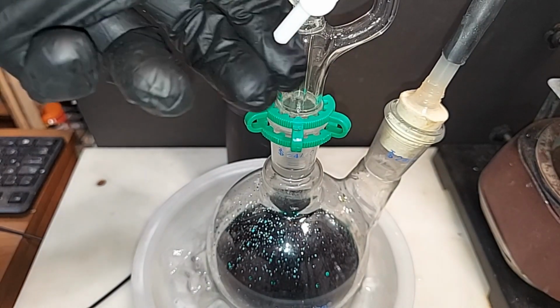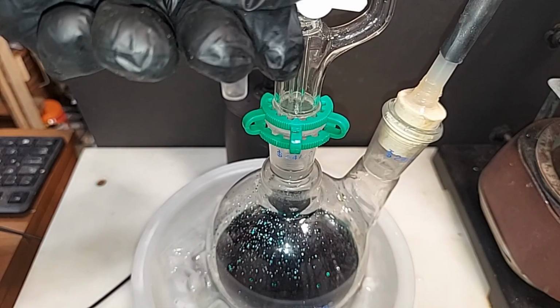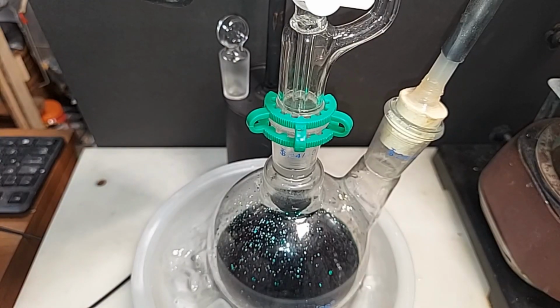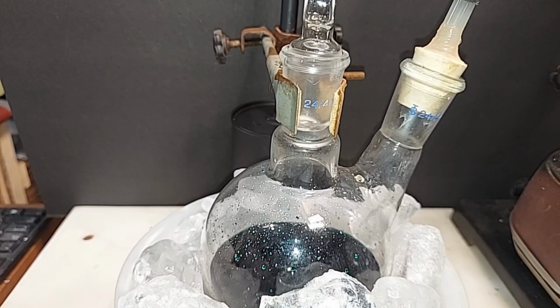Everything just dripped through. That took just over an hour to do, so I'm going to turn this off right here. And I'm going to take it apart, at least the top addition funnel here, because it's going to mix for at least another 2 hours. Added some more ice, took off the addition funnel, and like I said, it's going to mix for a couple hours at least, and then we'll move on to the distillation.